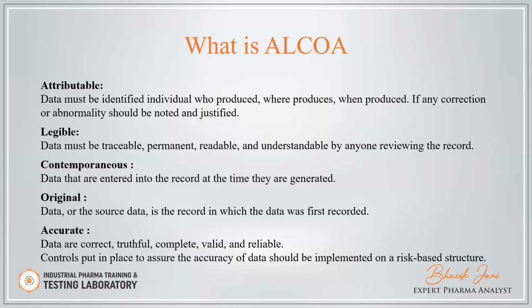You have to mention all these details in your logbook. After mentioning the start time, you start your weighing activity. After completion of the weighing activity, you enter the end time and then leave the balance. This is called an online entry, contemporaneous. But if you mention the start time and end time at the same time, that means it's not contemporaneous.